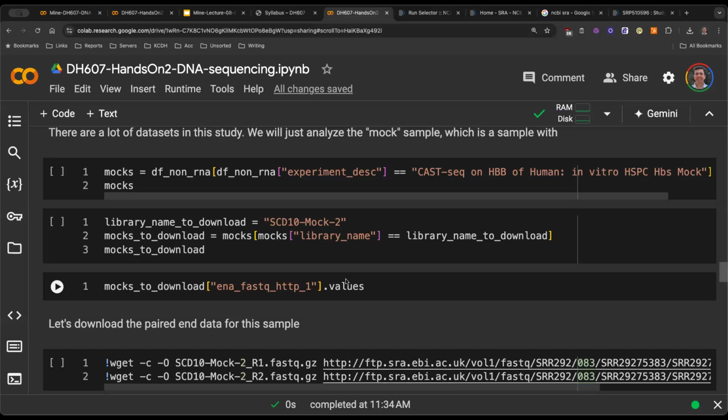It's a very painful format to work with because you download the SRA format, you have to convert it to FASTQ. That takes time, and it just blows up your hard disk and so on. Ideally, it is supposed to be less bulky than FASTQ, but I don't think it really works for this kind of analysis. So we download the FASTQ files directly, okay? Everyone remembers what a FASTQ file was?